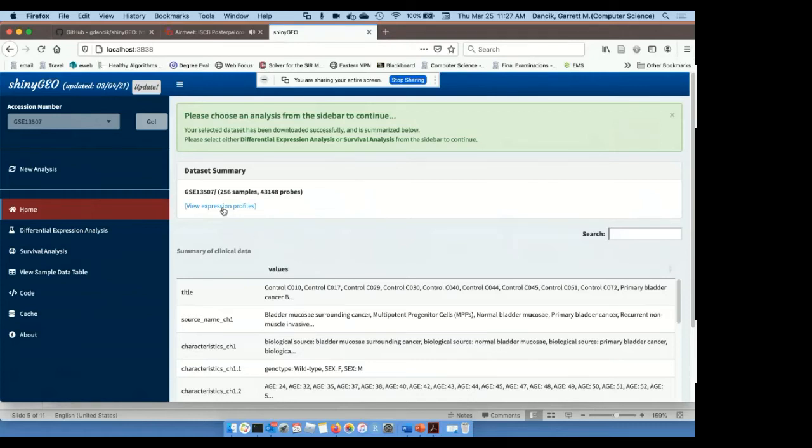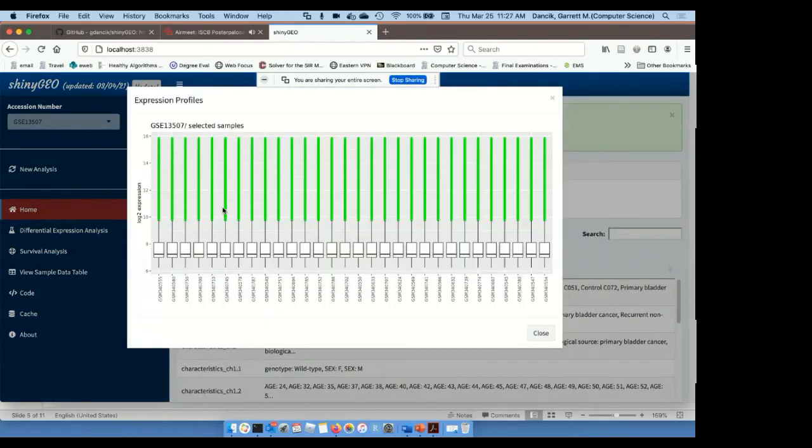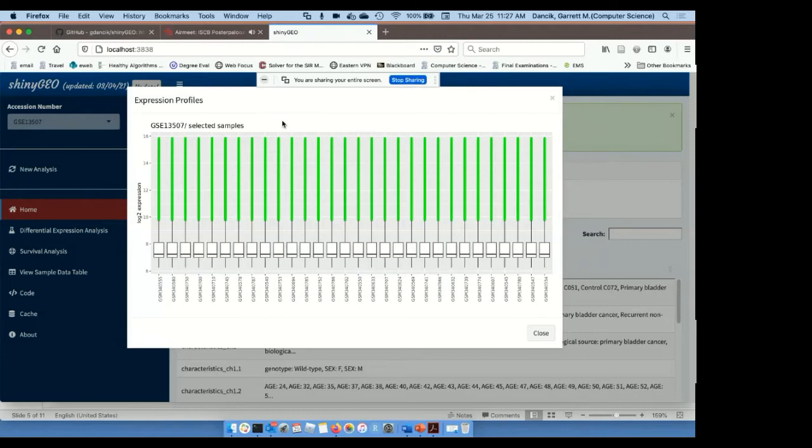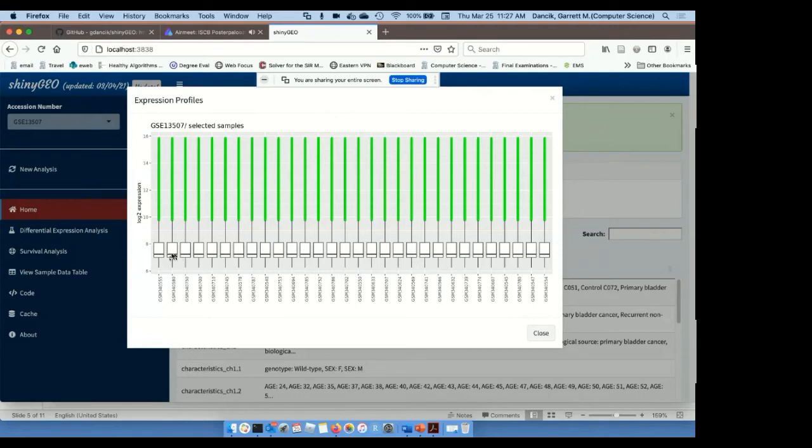The first thing we can do is click View Expression Profiles. This generates box plots that show the distribution of expression across each sample, and so this allows us to confirm whether the data has been processed correctly and normalized correctly. In this case, it has, so we can compare expression from one sample to another.